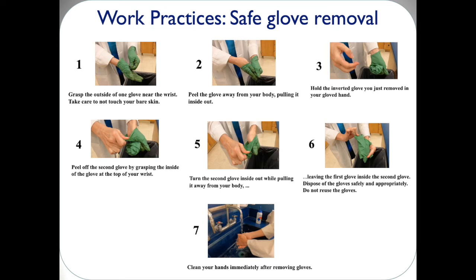Peel off the second glove by grasping the inside of the glove at the top of your wrist. Turn the second glove inside out while pulling it away from your body, leaving the first glove inside the second glove. Dispose of the gloves safely and appropriately. Do not reuse the gloves. Clean your hands immediately after removing gloves.